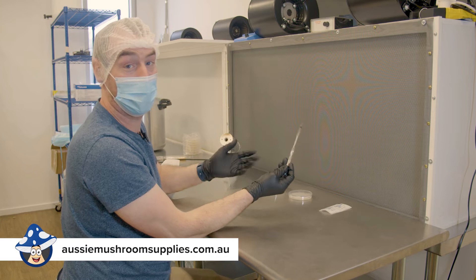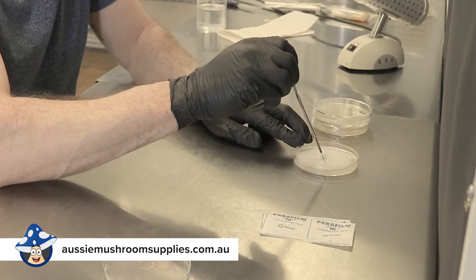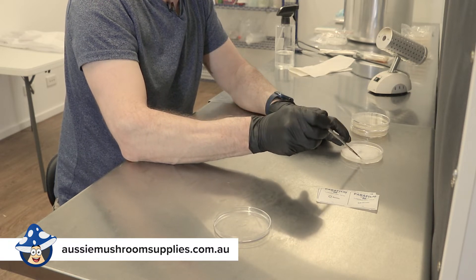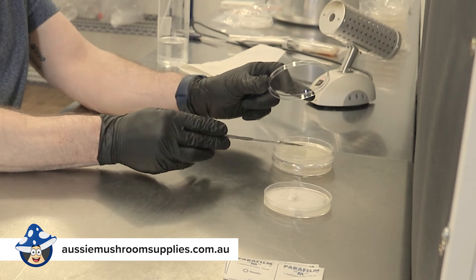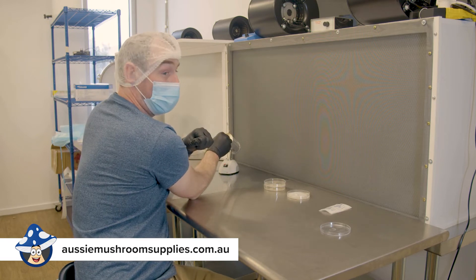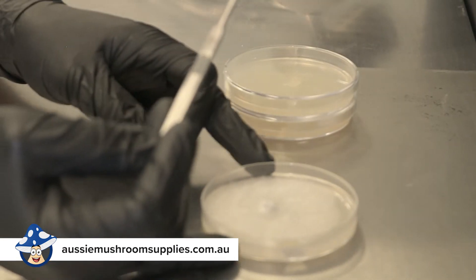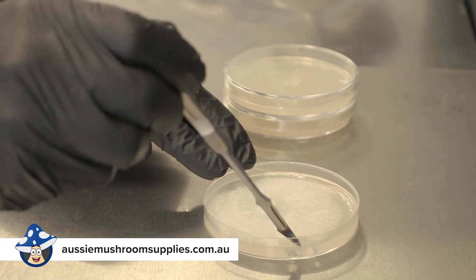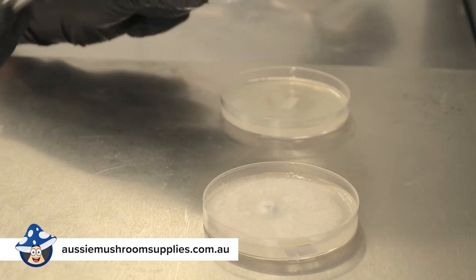Before we cut the mycelium, cool the scalpel down, otherwise it's going to damage it from the heat. Always working from the back, you want to cut on the leading edge — a little square — and working from behind, putting it in your new agar plate. Obviously you need to sterilize your tool again between transfers in case anything lands on your scalpel when you're moving around. Make sure you cool down your scalpel between transfers, then cut out a little square from your leading edge, working from the back.